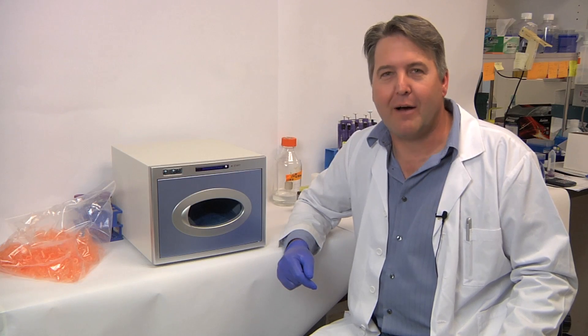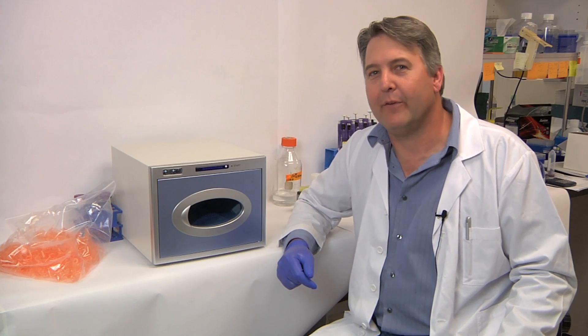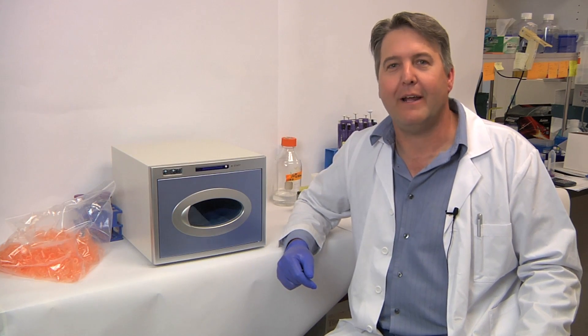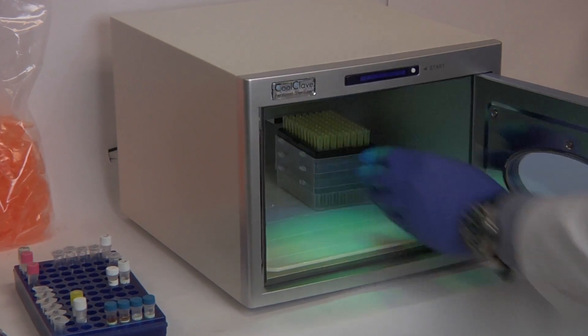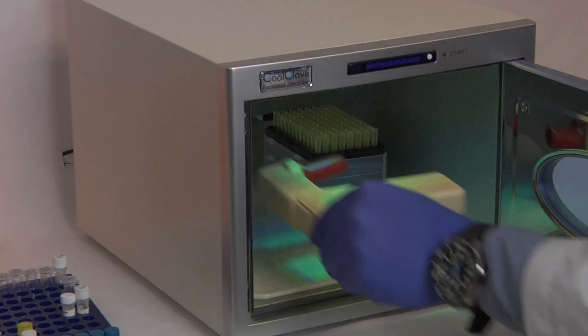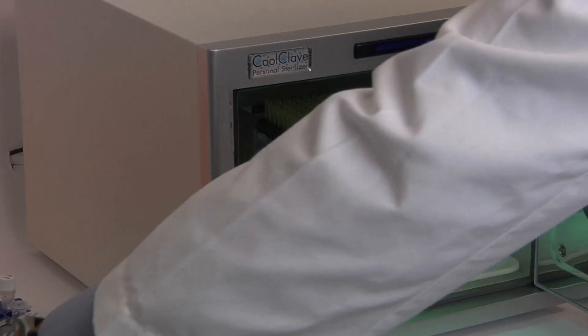It's the first benchtop device designed to sterilize and decontaminate everyday lab items like pipettes and pipette tips, plates, plastic tubes, and everyday electronics.